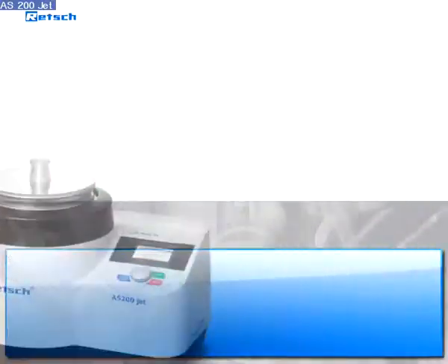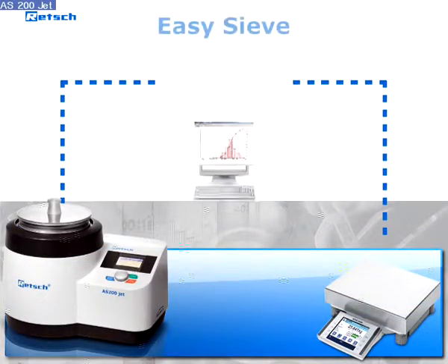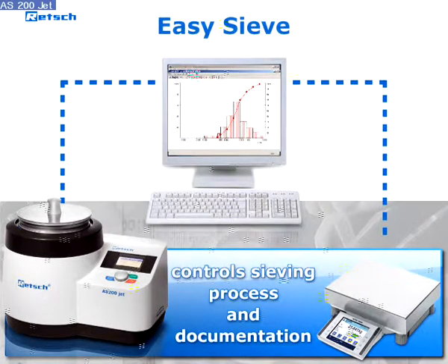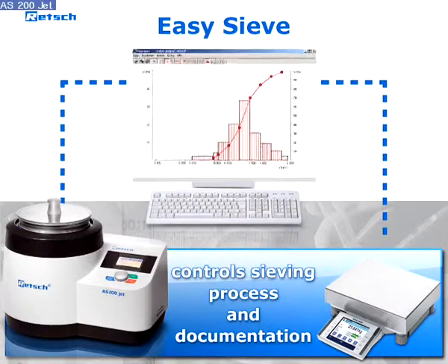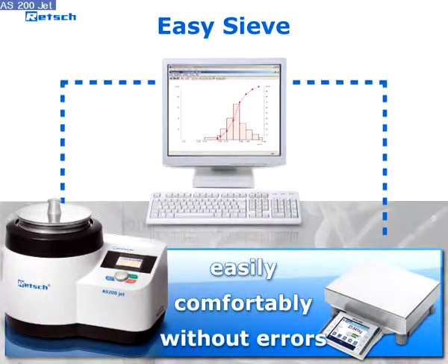Thanks to an integrated interface, the AS200 Jet can be controlled with the evaluation software EasySieve. This program allows to control the entire sieving process and the subsequent documentation, easily, comfortably, and without errors.